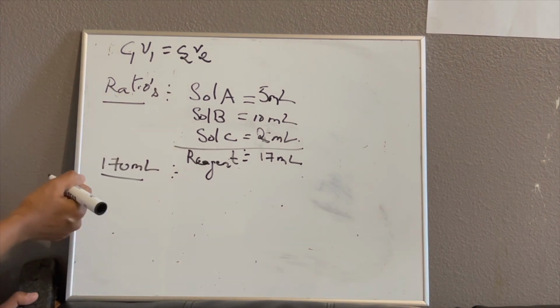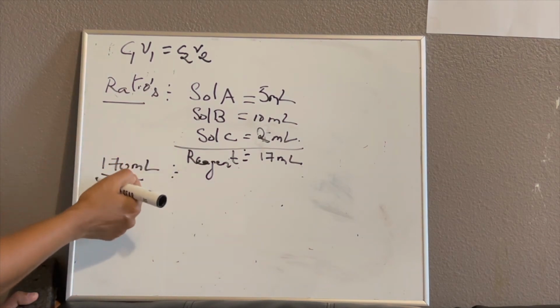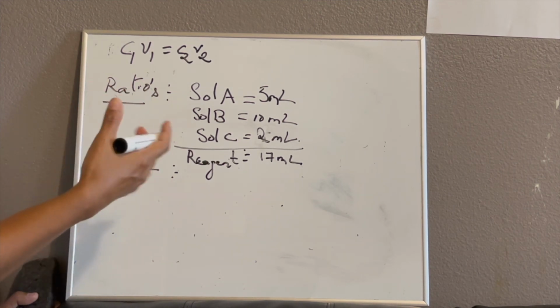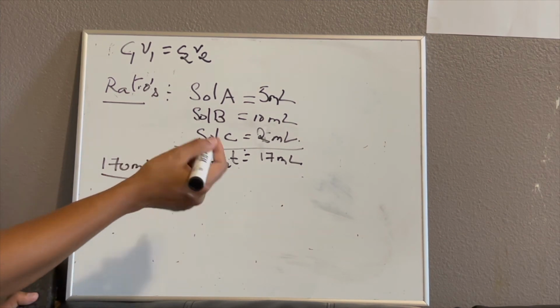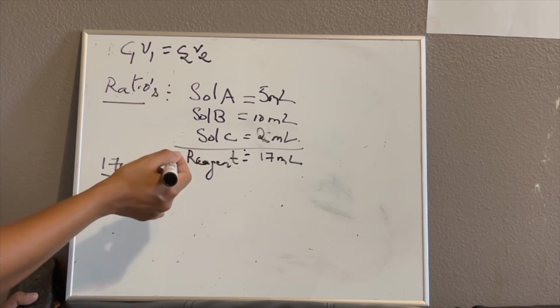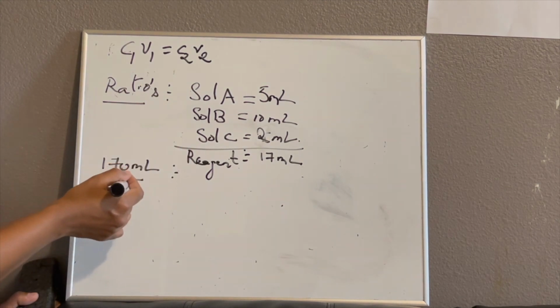And one more thing is, when you are making large volumes of the detection reagents, you need to give 5 ml of dead volume, because some solution will be lost during pipetting error. So you need to make plus 5 or 10, depending upon how you are pipetting, so that it cancels out the dead volume and you'll have sufficient amount when you are working with your assay.